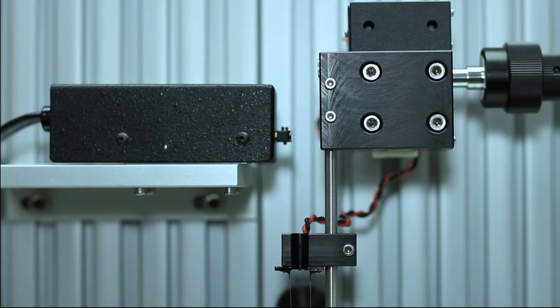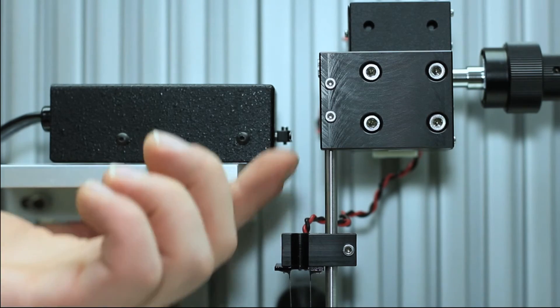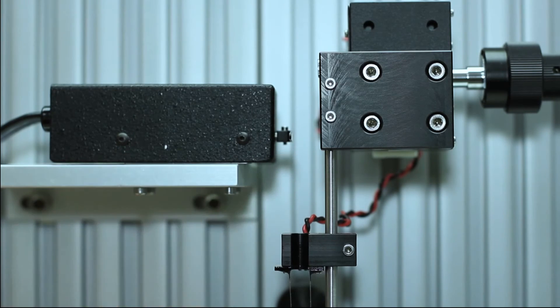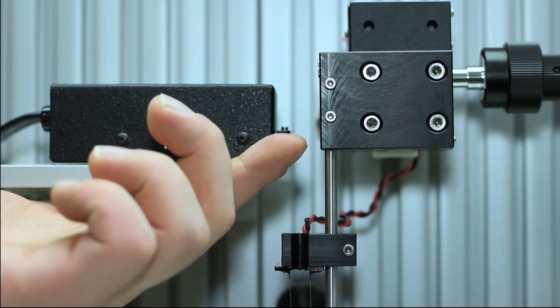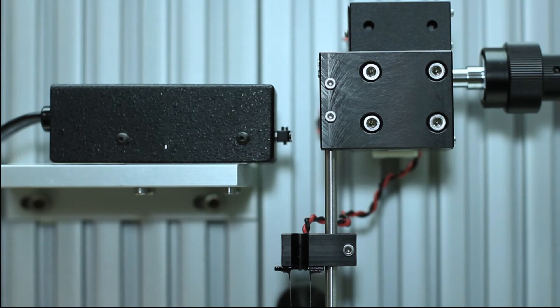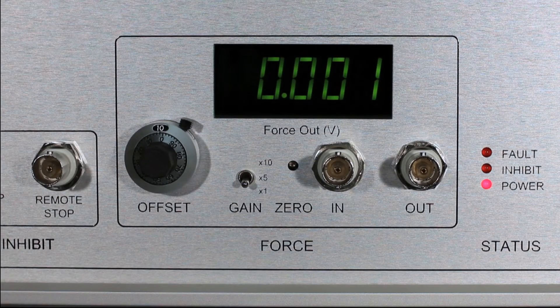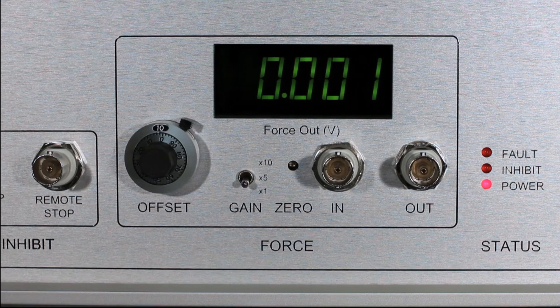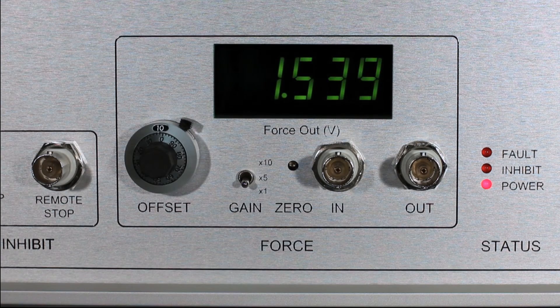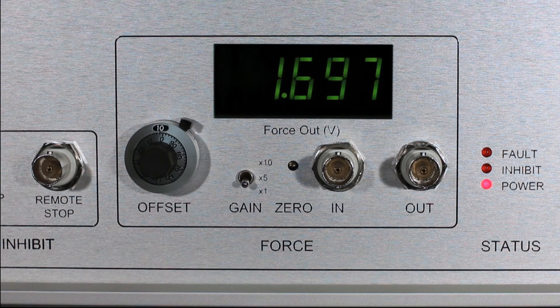Go back and tap the lever arm. You should now feel plenty of resistance. The force out display should change significantly as well.